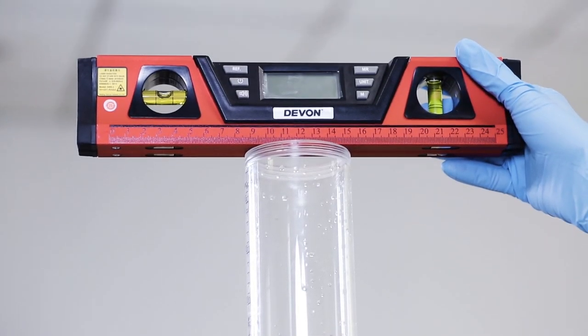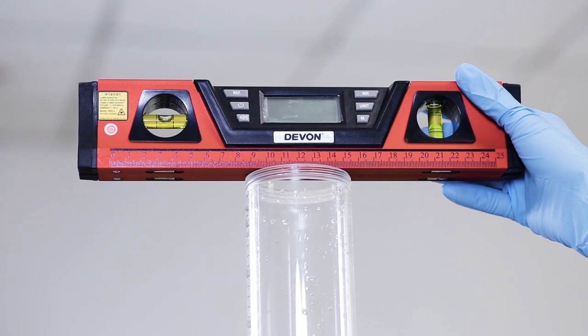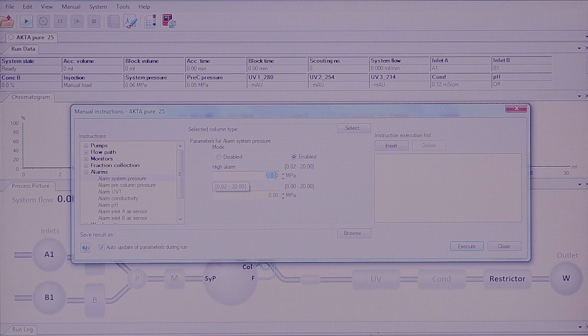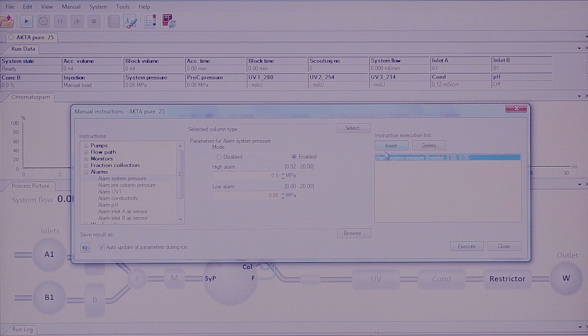Level the column. If not level, the packed column may produce broad or crooked bands. Before start, set a pressure alarm in Unicorn according to the column hardware to be used. This information is found in the instructions for use for your column. In this case it is 0.5 MPa.